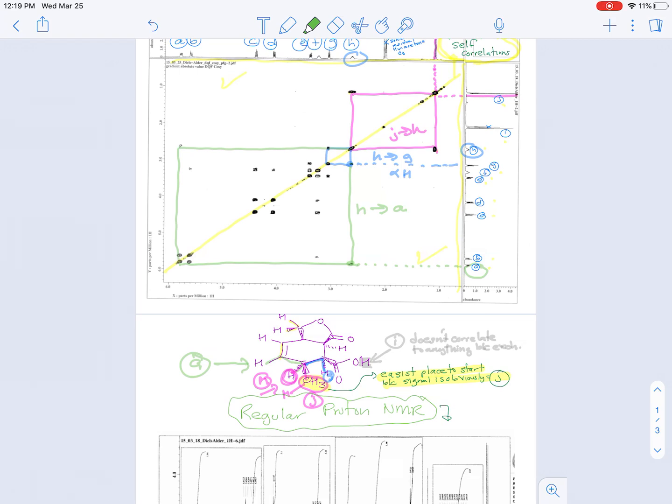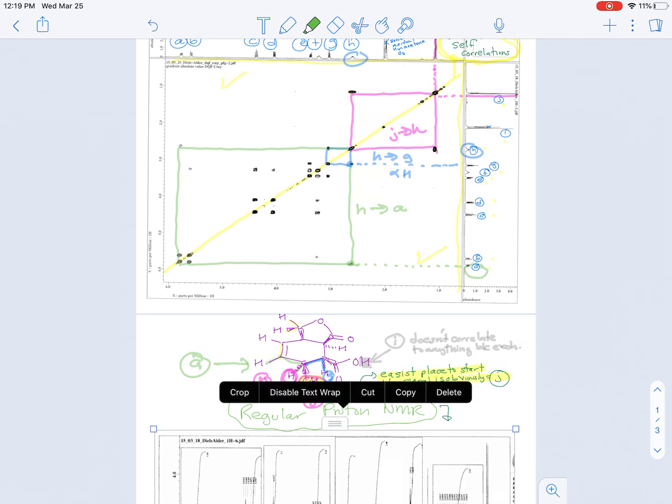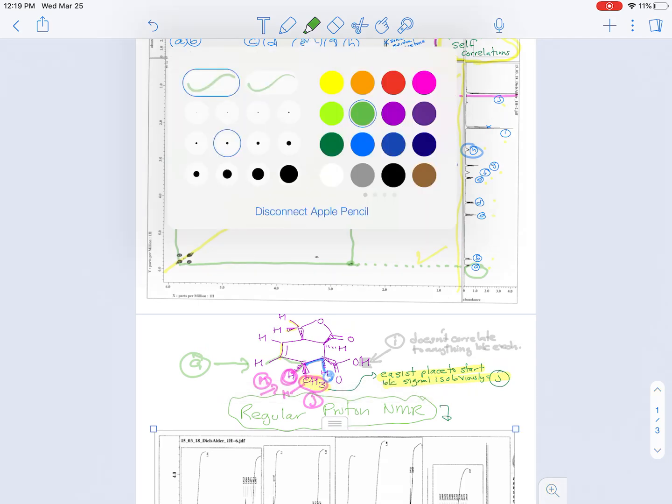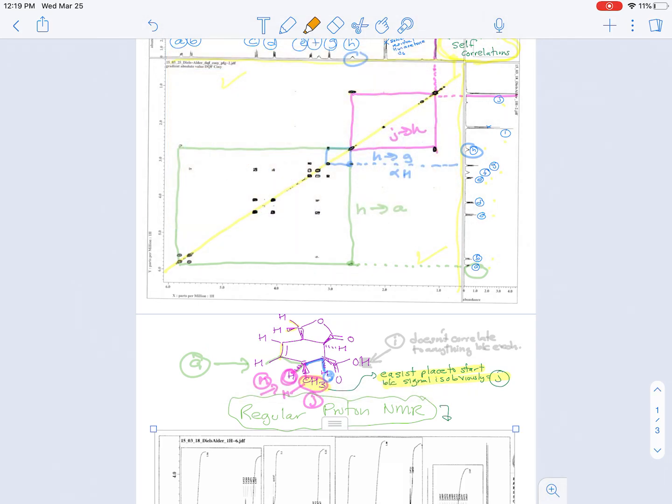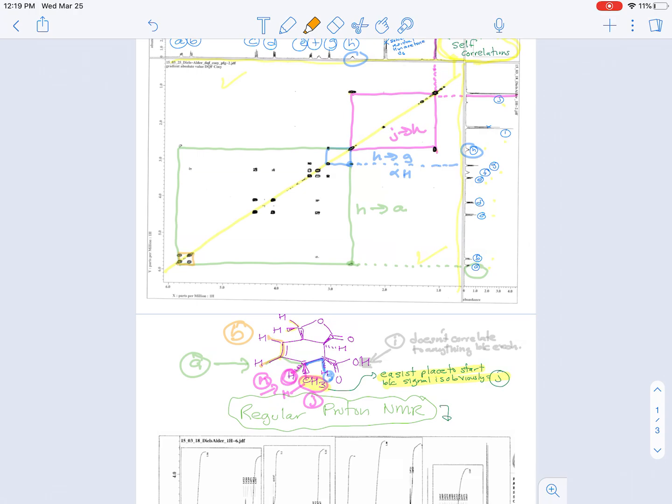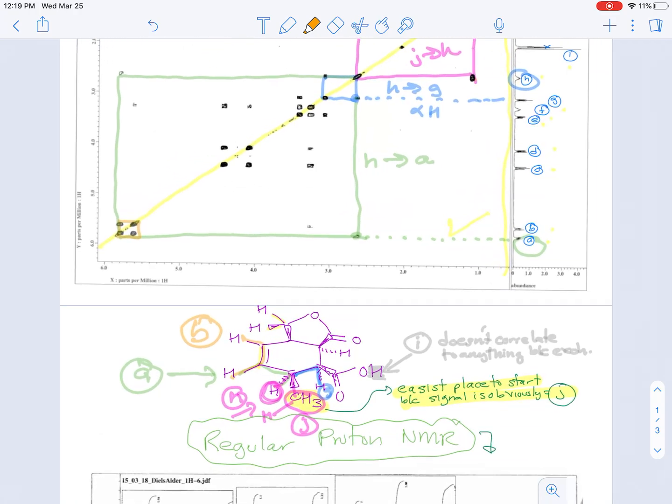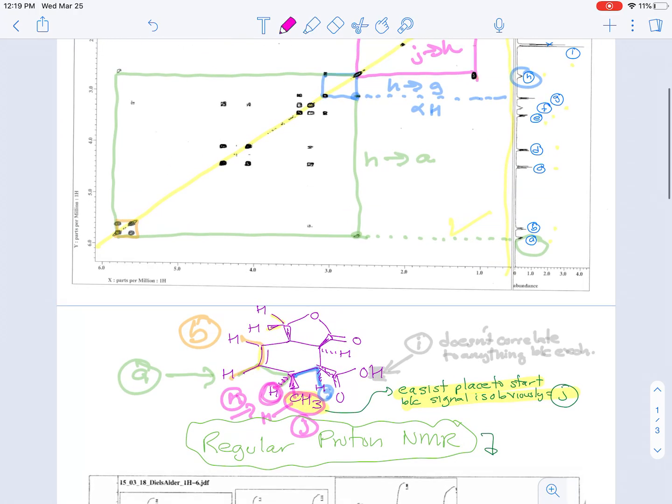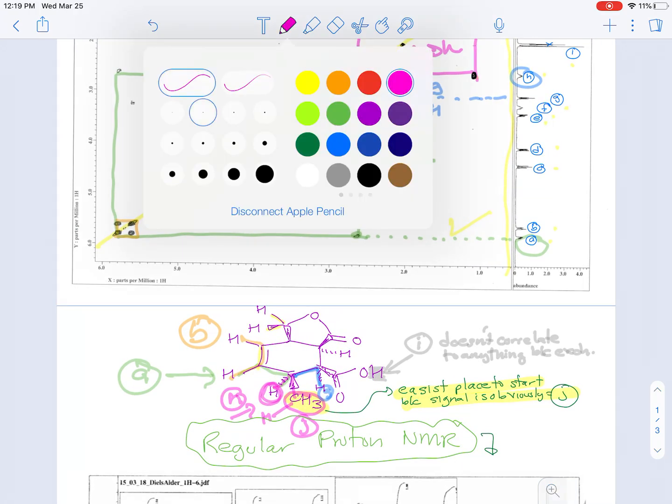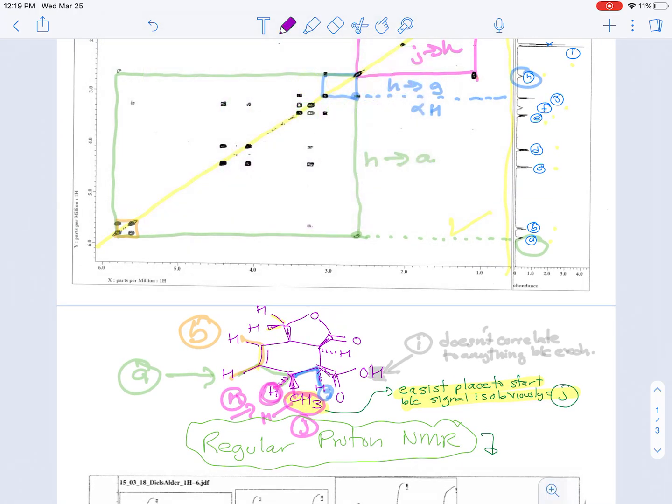And then what you can do is you can just keep going around the ring, and you're going to do some of it clockwise and some of it counterclockwise. So for example, A is going to correlate to B, which is the other vinyl one. So there's that correlation.